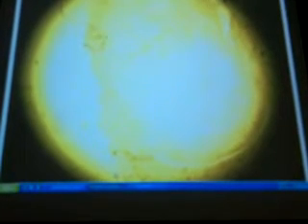So for the penis, here's what you should be able to identify. Let's go back to 20X. So there's a lot of stuff here. This is a mammal penis. I don't know which mammal.